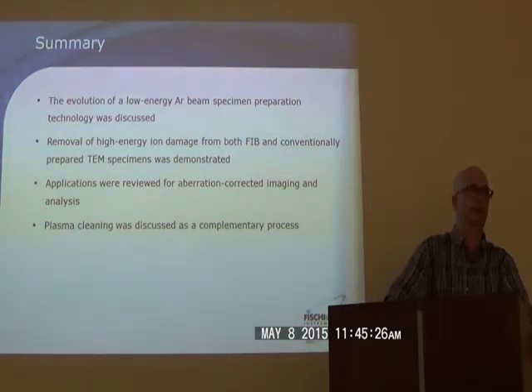So would there be like a limit on how thick of a sample you can put in to begin with to be able to image something with the STEM detector? Well, that's the thing. If you get a better image with a higher energy, but then you lose the ability to see the thin samples because it goes right through it. So you have to kind of decide how good of an image you need versus how close you want to be able to monitor the thickness.